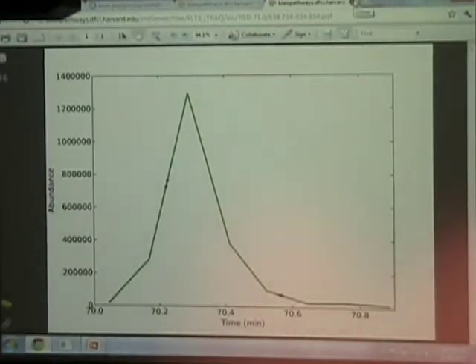And it's accessing the raw file. So when you share data this way, you're sharing everything. And we need a way to do that in our field because, well, I'll get to that maybe in the overview slide. This is a tool for both showing the biological context of your experiment, but allowing your customer or your collaborator to dig deep into the lowest level of the data.